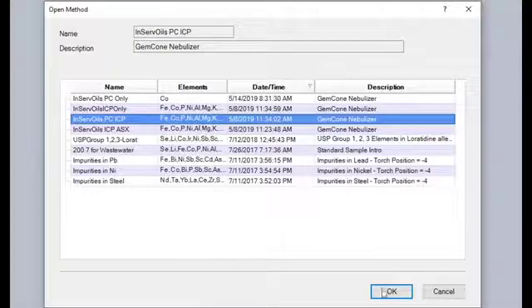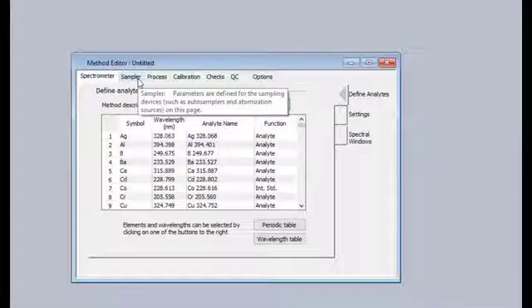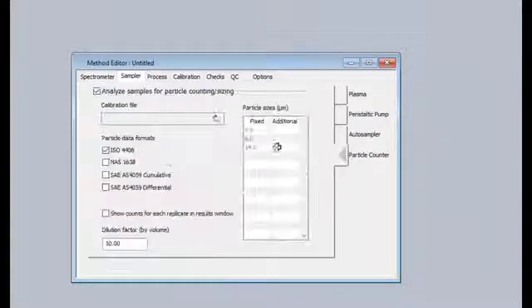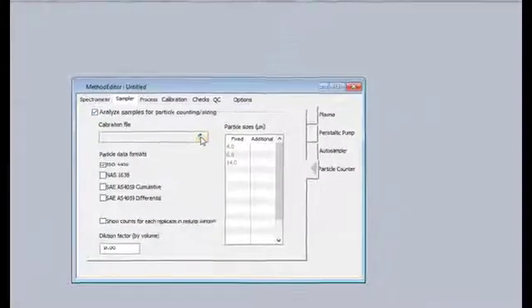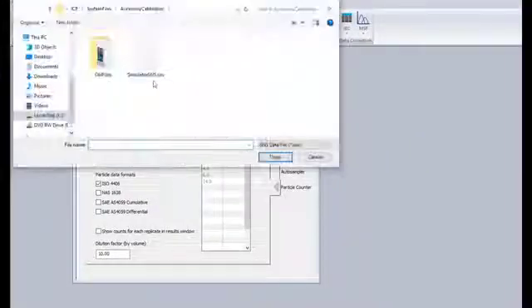Once opened, the sampler particle counter tab contains all of the controls for the particle counter, including an option to enable and disable the particle counting analysis from method to method. If enabled, a calibration file for the sensor must be selected for the system to return valid particle count results.